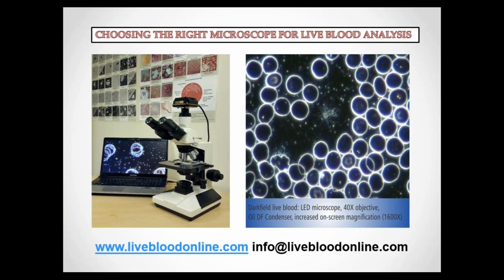Absolutely. With the normal bright field type of illumination, we're not really able to see everything that you could potentially see in a sample, especially when it comes to live blood. This is the reason why blood samples normally are stained, to allow the person analyzing the sample to see all those other elements that you can't normally see with a live unstained sample in bright field. In dark field, and also to a certain extent phase contrast, you can see those other elements, and effectively the sample is stained by light instead of by chemical means.